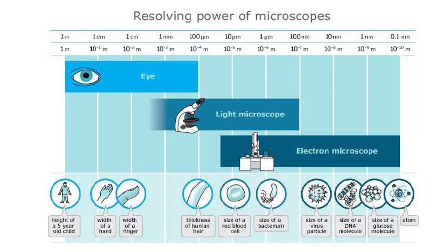And through electron microscope we can magnify a few lakhs times, and we can visualize even the structure of a DNA or any virus or any bacteria species, and also we can go up to crystal size through the electron microscope.